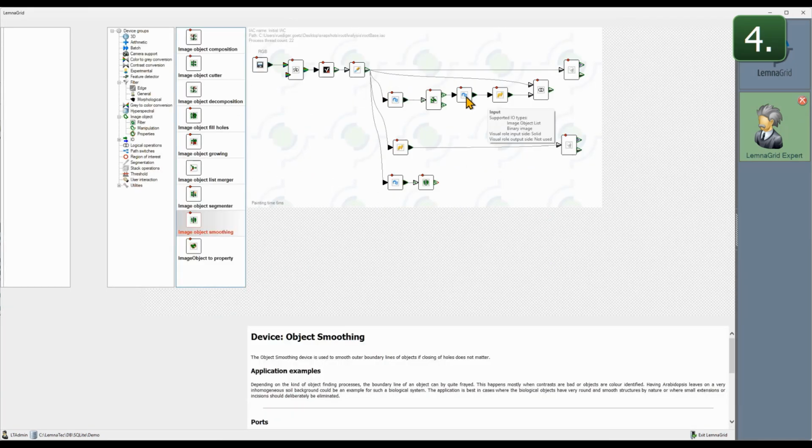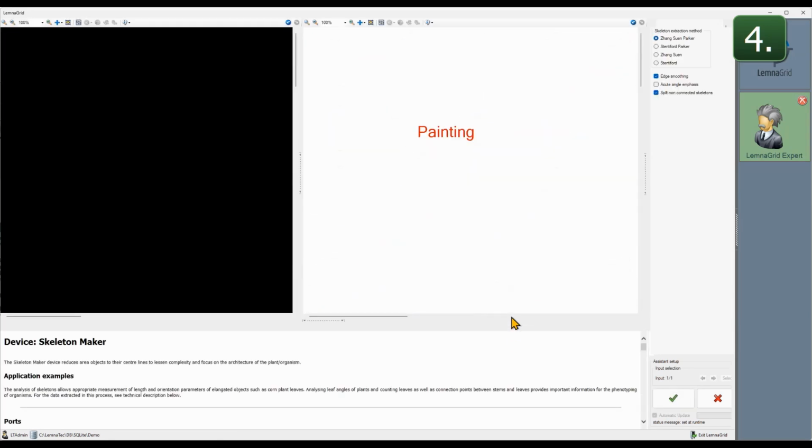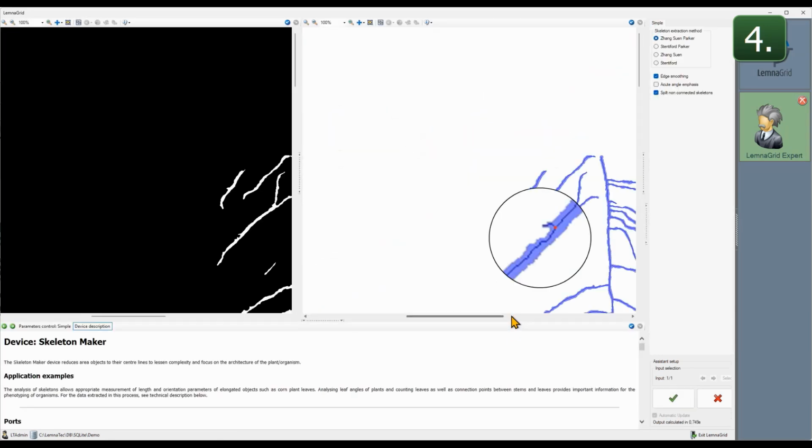If you convert this back to a binary image, the result is less prone to spurious side roots. As a result, we are left with just one spurious side root, at least at this position in the skeleton.